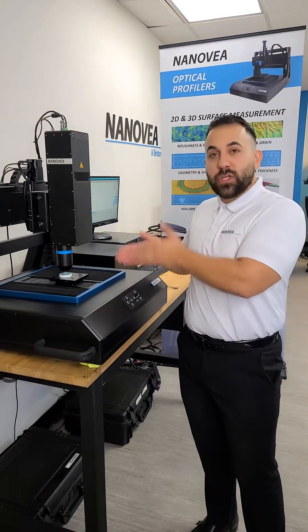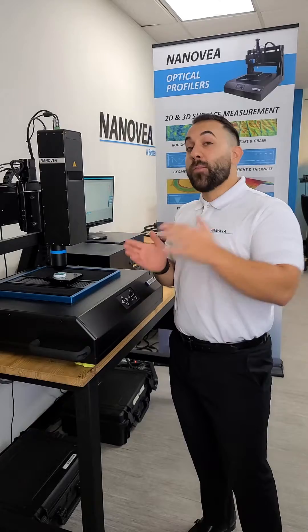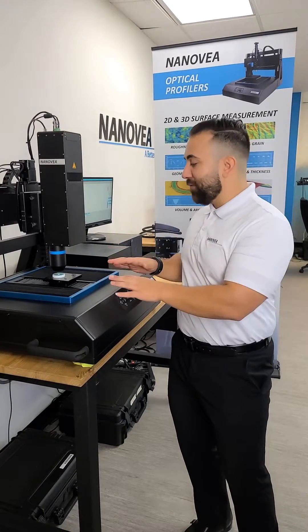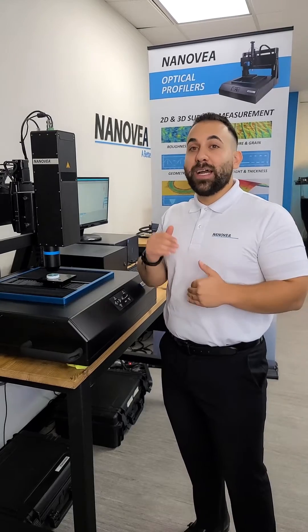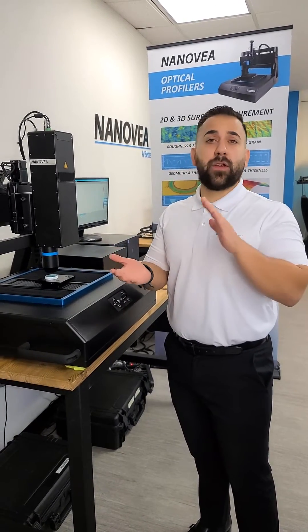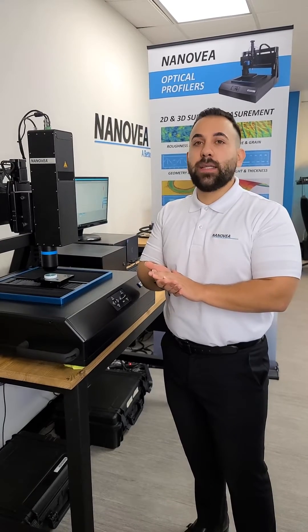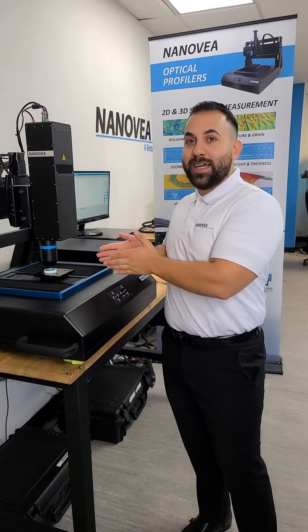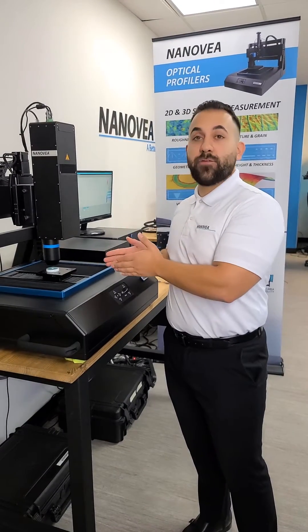What we're measuring from the surface itself is an actual data point. Some other profilometry — I'm not going to name any names — but what they do is they measure the surface, take it back to the computer, and try to figure out some stuff on the back end with algorithms. That can lead to variation in numbers, that can lead to variation in results. What we want is that whatever you're measuring is the exact thing that's on the surface of your material.